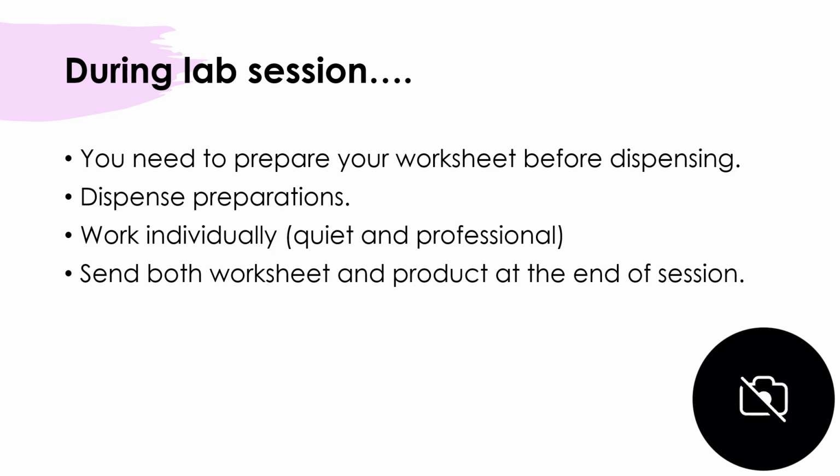During lab session, you have to prepare your worksheet and of course your dispensed medicine. You have to work individually, and at the end of the day, you have to send both items so that we can give you marks.